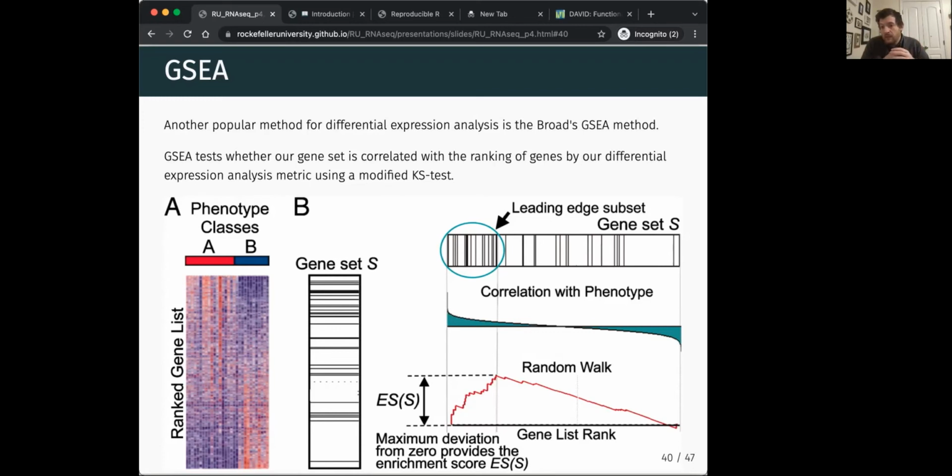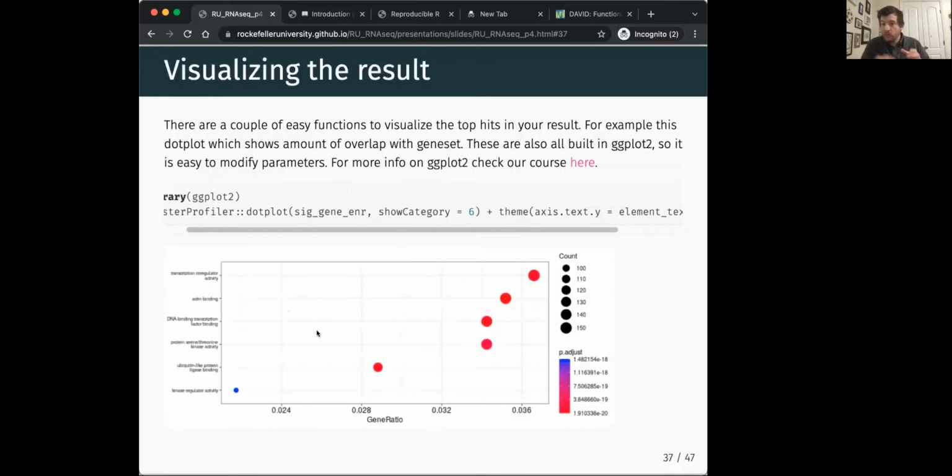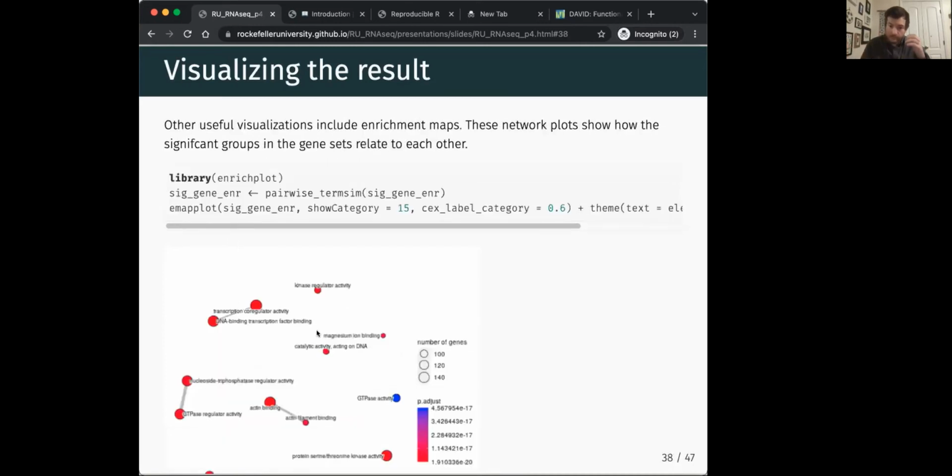Yeah. And the nice thing about this is there are tools, I didn't get into it, but there is a function within clusterProfiler called compareCluster, and you can run gene set analysis on multiple groups at once. So you could do all of your groups, like say we had our data set from earlier where we had 7 clusters, we could pass all 7 clusters of genes at once to the gene set analysis. And when we do this, it will show me the result of all 7 at once relative to each other, so you get an understanding of how they are related to each other.